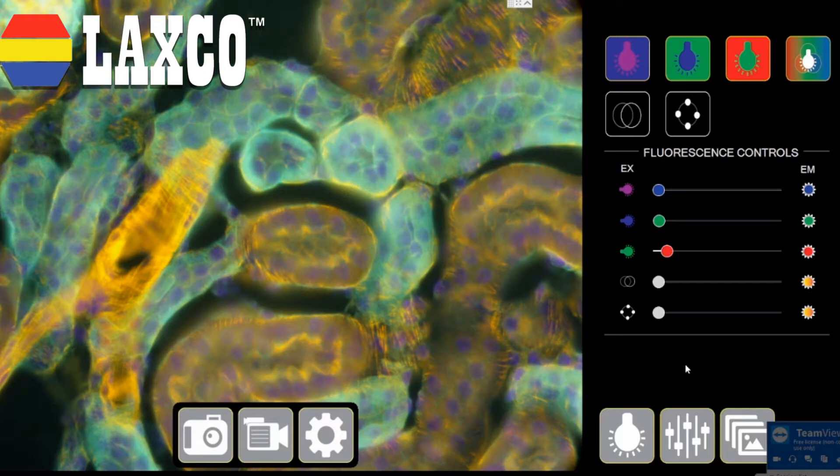This is a live image. The detailing over here is mind-blowing. The distal tubules, the proximal tubules, the glomerulus are all clearly visible. Visualizing immunopathology slides of kidney sections is always fun. Currently I have all three different channels superimposed and the results are just mind-blowing — an extreme level of detailing. This is currently under 40x fluoride objective and the crosstalk is completely removed, as you can see, through our patented Cbullet software.